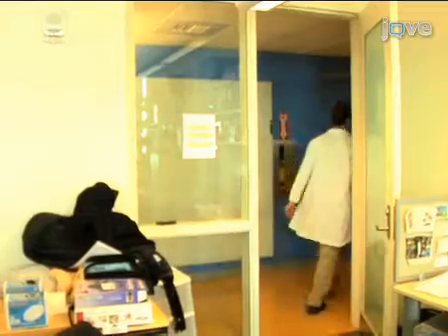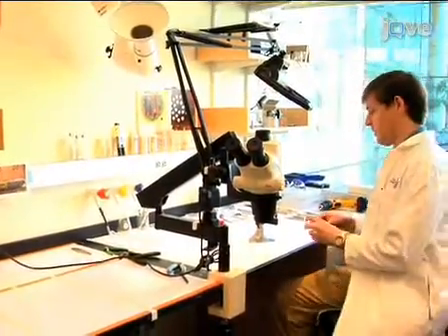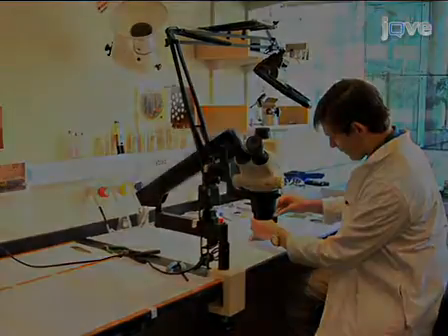First, we will show you how we designed our microdrive array. Then we will head over to the workshop where Steve and Stuart will show us how to process the raw materials and how to assemble them into a fully functional device. So let's get started.